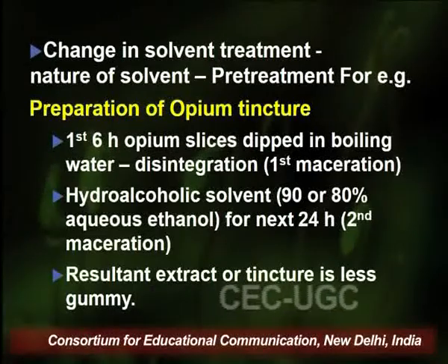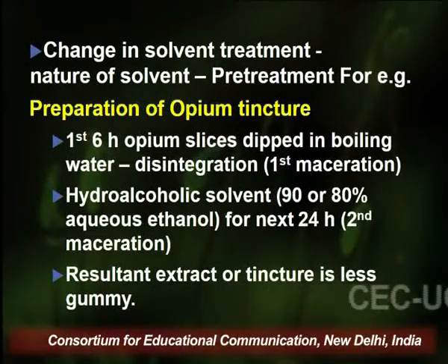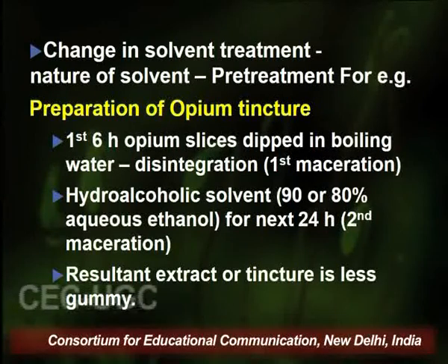boiling water. And once the drug is swollen or disintegrated, it helps in the formation of microcapillaries between the drug particles, which makes the entry of the solvent into the drug matrix quite easy. Now this treatment we consider as the first maceration. So once the first maceration of 6 hours is complete, we change the nature of the solvent. In place of water, we now use a hydroalcoholic solvent, which is normally 80 to 90% aqueous ethanol.